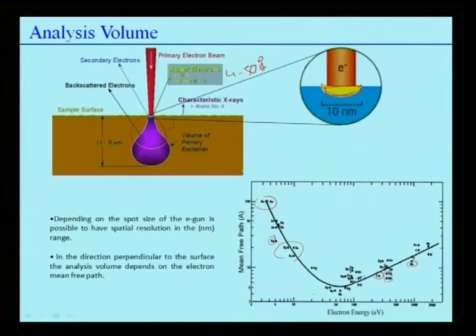So the mean free path depends on electron excitation energy; it is very high for gold, silver and others, but very low for beryllium, phosphorus and iron also. That tells us that the perpendicular depth will vary depending on the mean free path of the electron and different elements. This also sets what kind of elements you can analyze from a particular depth.